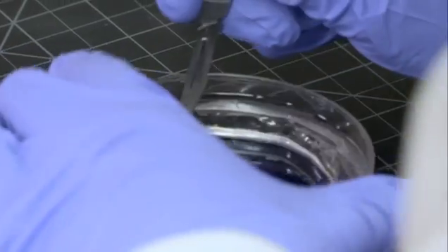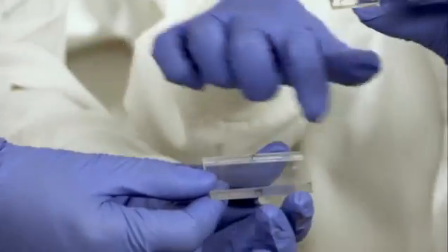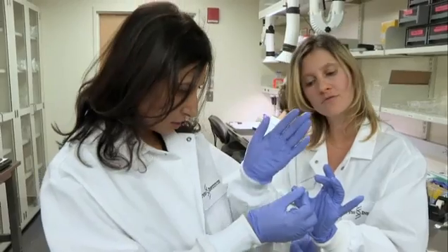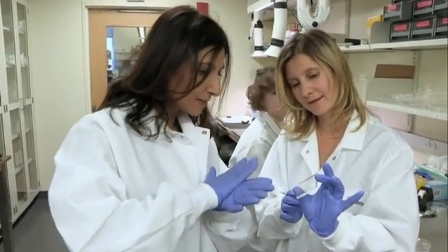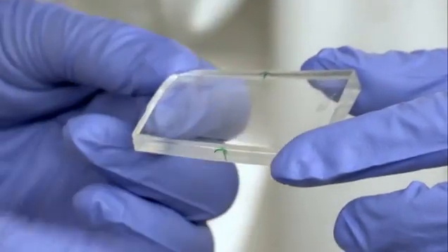And she's going to cut out a very, very thin membrane and it's right on here but it's so thin that you can barely see it. You really can't. It almost looks like a piece of sellotape stuck or a piece of clear glass. Except it's going to be even thinner than that.